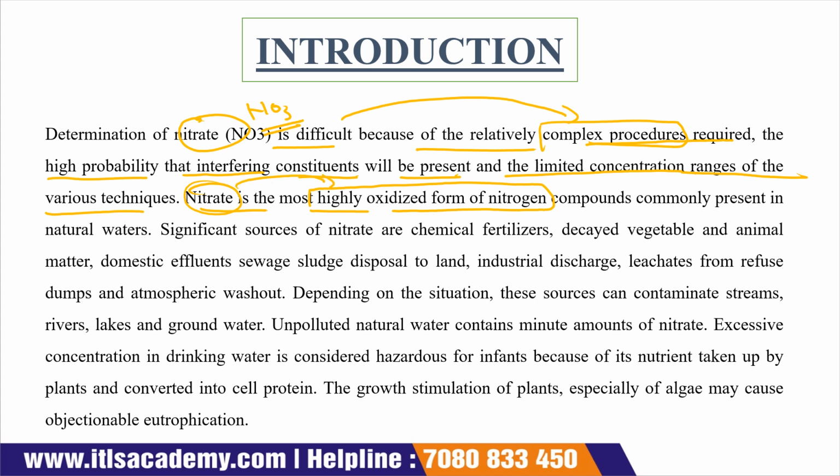Nitrates are a highly oxidized form of nitrogen compound commonly present in natural water.